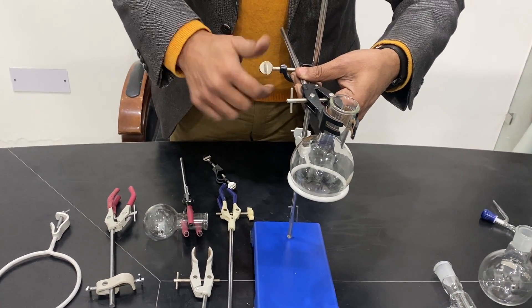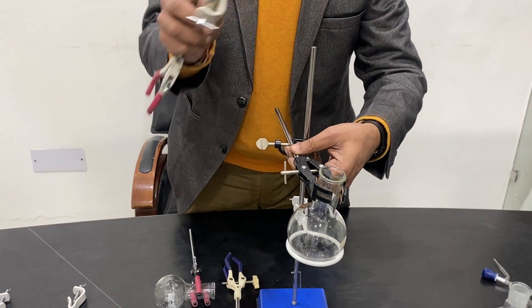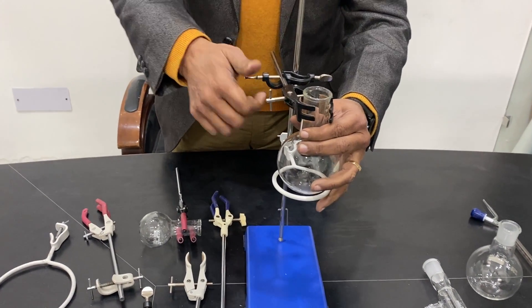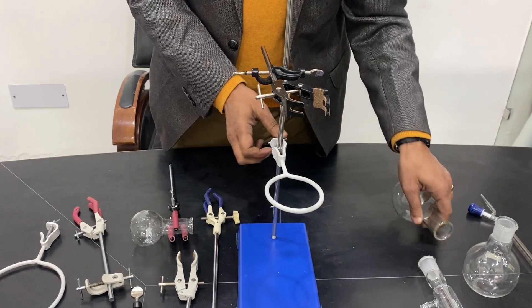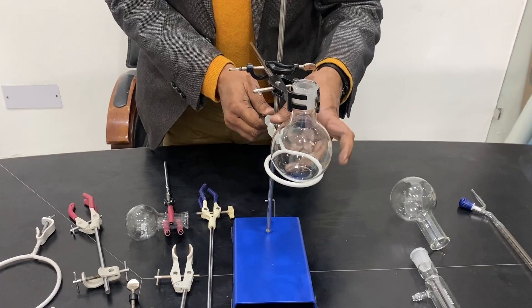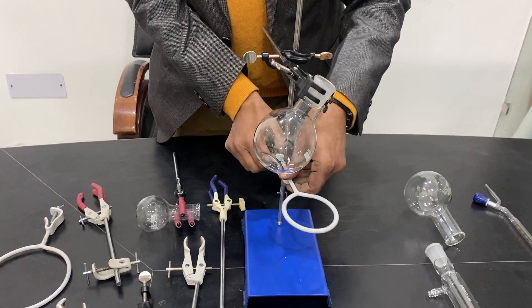This is called a boss head. When using the strip type, you can fix it by inserting the rod from this hole or the other way. To hold something, first hold the clamp, then open it and take out the lower part. Remove it and demonstrate the fitting by tightening it. Then close the upper part and slowly adjust it to the center. Now I bring it back here to the bottom.